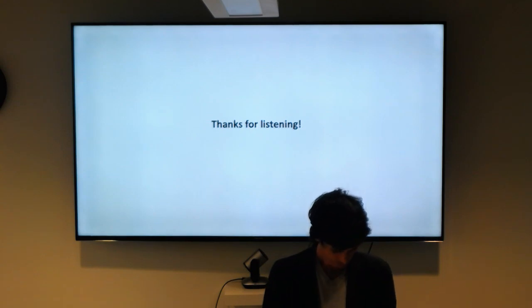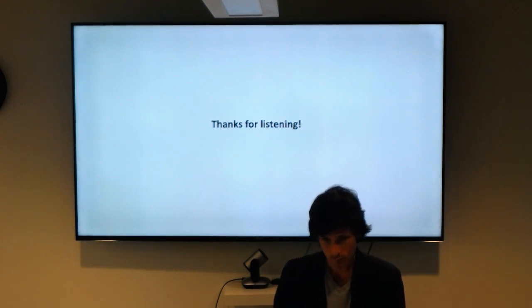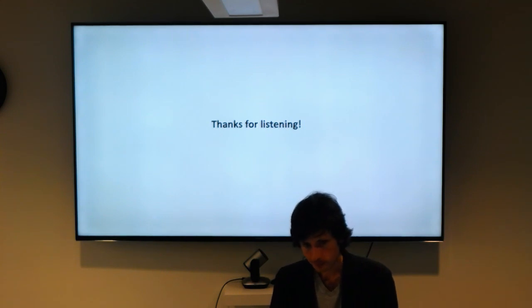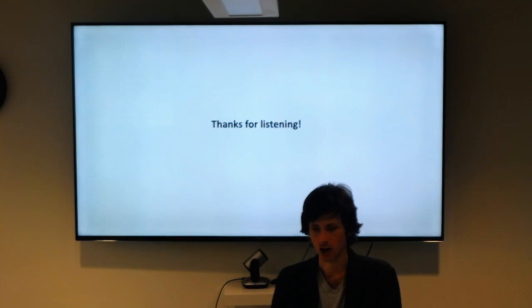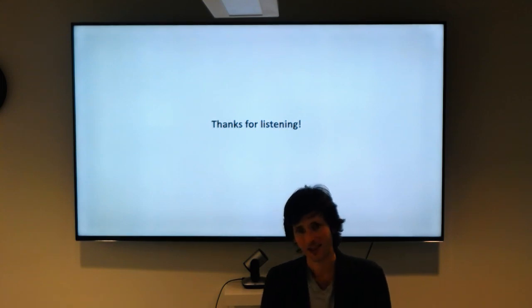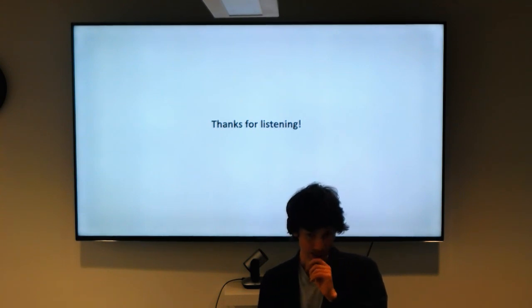I've done no model building, so this is always a good lecture to learn from. If I'm just lazy, and being lazy is good, or I just don't know, what's the lowest resolution that I can start automated map building? Yeah, I mean, you could try at 3.5, but honestly, I still wouldn't advise it anyway.